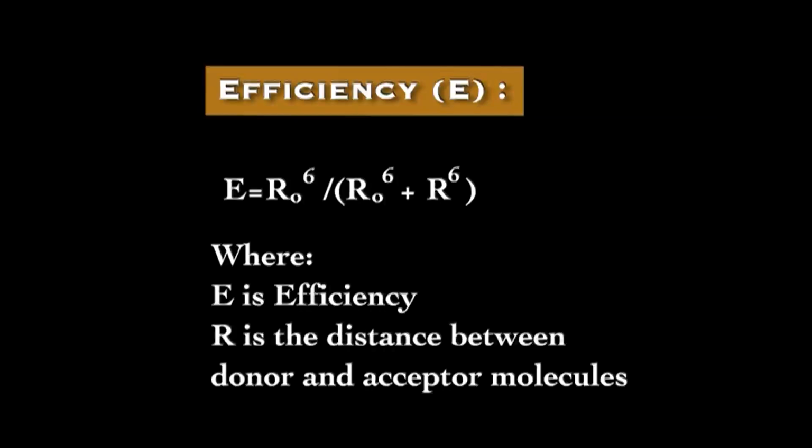What we can see is that this FRET technology can be used to identify interaction of different proteins which are tagged to fluorophores. Sir, I have a question. What are the compounds that can be used as a fluorophore in FRET? Now, very good question. So let's take an example.